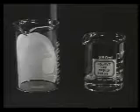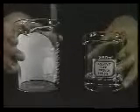Add sufficient developing solvent to leave about half a centimeter of solvent in the bottom of the tank and wet the filter papers thoroughly.